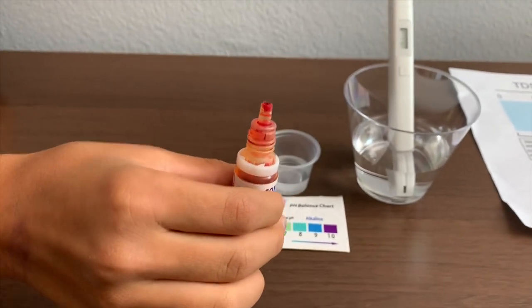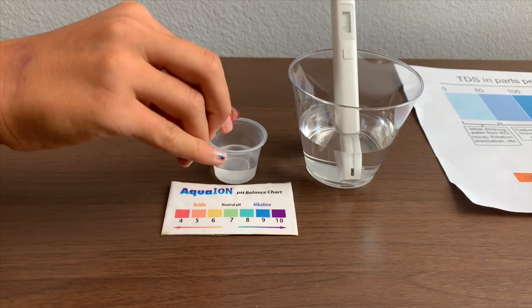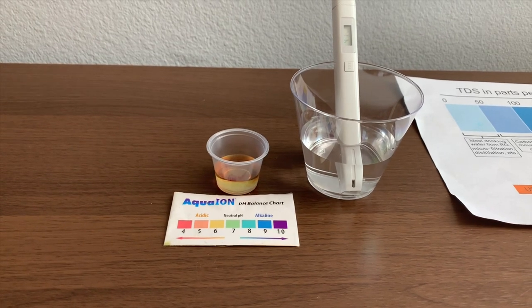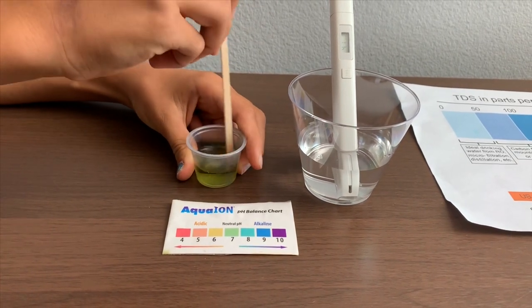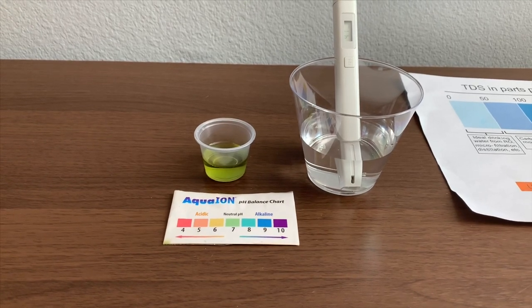Now let's test the pH level. Make sure you do two drops only. Let's stir it in for a better result. I'll give that a seven — that is neutral pH.